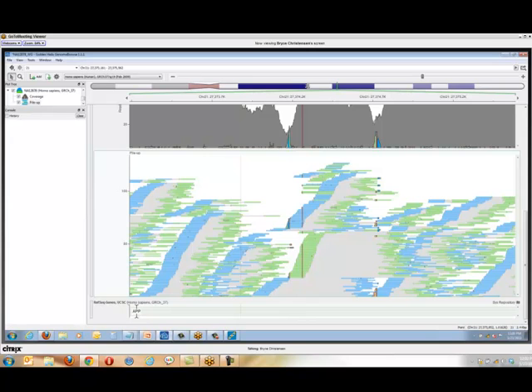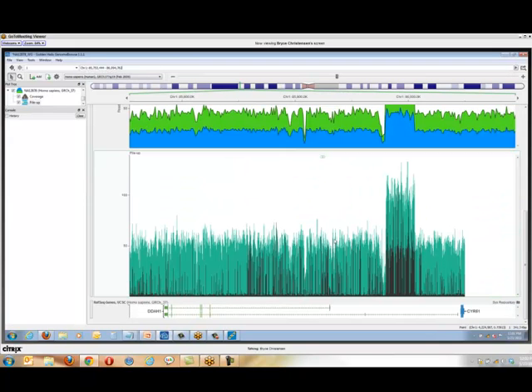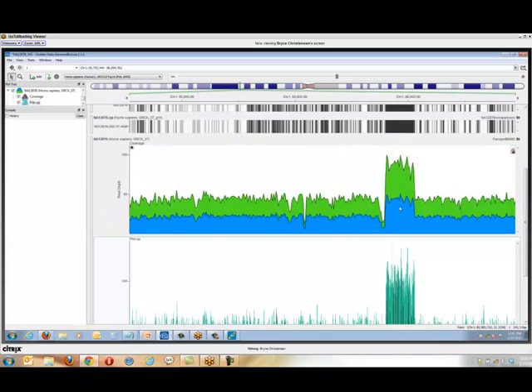One more thing I want to look at in this sample is... copy this location, come up and paste it. I'll give you an idea. This is a copy number variant. If we look up here at the top across this coverage histogram, we see we've got pretty consistent, right around 40, 50x coverage. And then suddenly in one location it spikes up to almost double that.